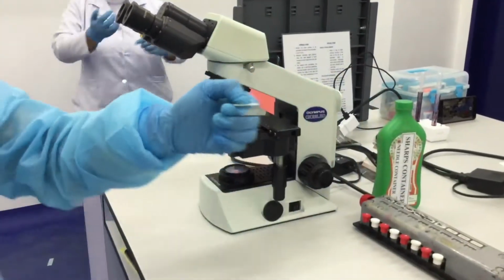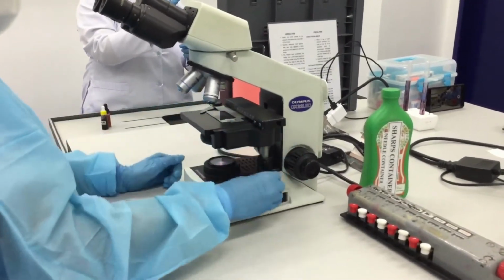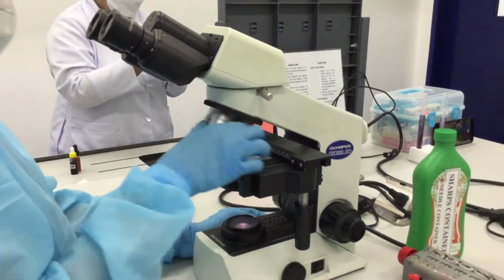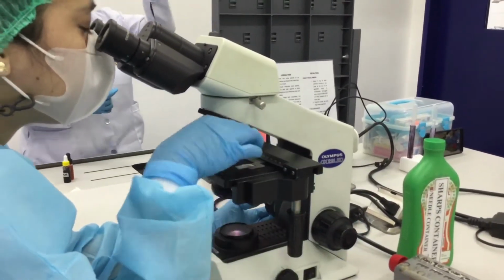In the examination of the smear for sperm viability, it has been observed that there are 76% alive sperm cells and that 24% are dead.